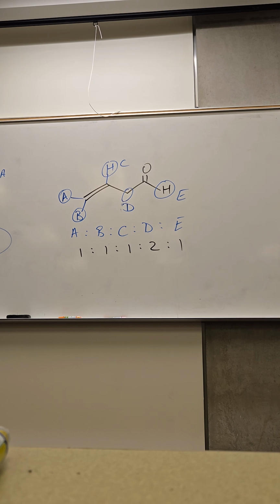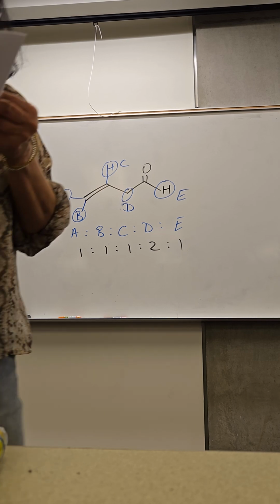Sorry, Eric, I'm not able to hear you. Chemical environment. Chemical environment, yes, absolutely. Meaning chemical shift. Where in the spectrum does a signal show up? So let's talk about that.